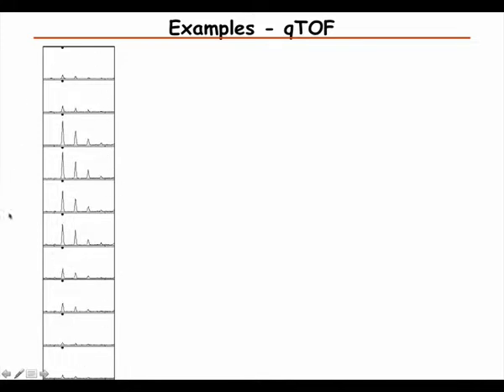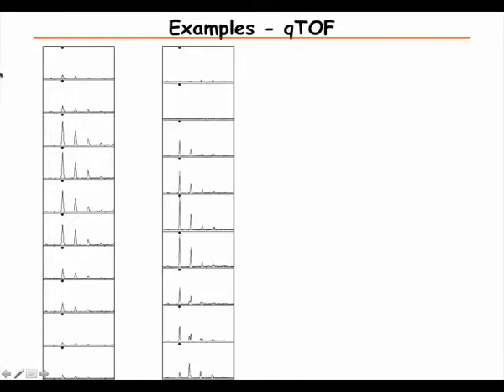And this is a very clean case when there is not much interference. Another case here, it starts out well, but then as they disappear, we see that there is another peak coming up here, and finally we have a very different distribution here. So there is an overlap.